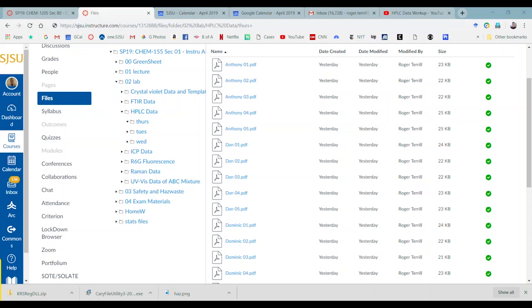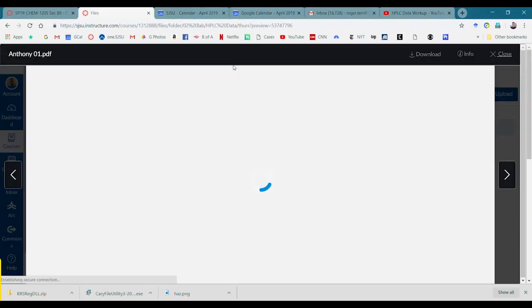Alrighty, so this is try number 2 to get the HPLC data workup video correct. We start with the file that you're going to need, and the 5 printouts are in HPLC data, right? And we're going to start with Anthony because he's the lucky victim here, right?